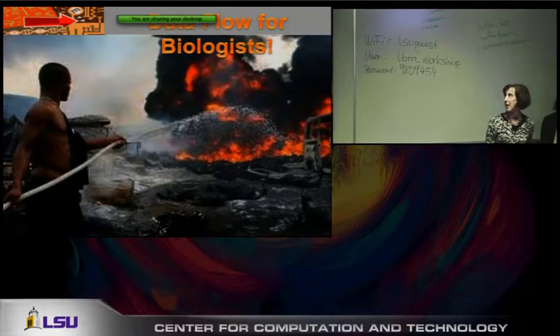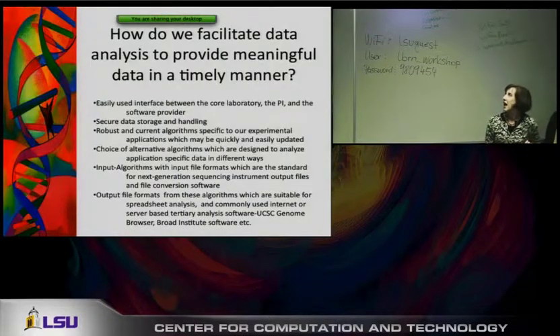We're running a SOLiD sequencer from Life Technologies, and it's a short read sequencer. So our questions are, how do we facilitate data analysis to provide meaningful data in a timely manner? And what we need are easily used interfaces between the core laboratory, the principal investigators, and the software provider. We need secure data storage and handling.